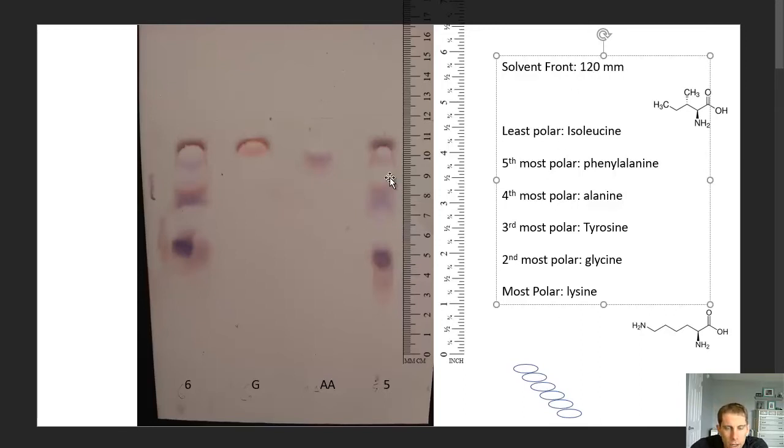And then looking at our individual amino acids on here, this is not easy to interpret. So I'm going to start out and essentially put a circle over each of them. It was actually pretty convenient. We had these 2 unknowns to give us an idea of what our top 2 are in our molecular weight ladder. So this first unknown definitely had the highest RF value.